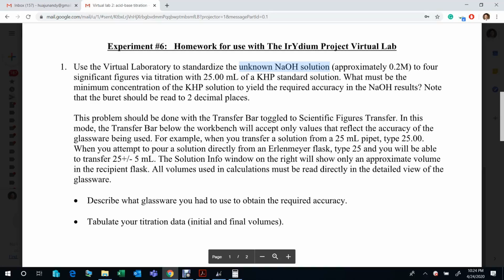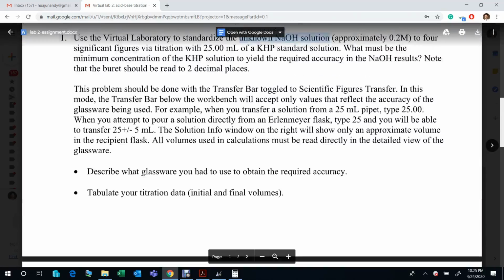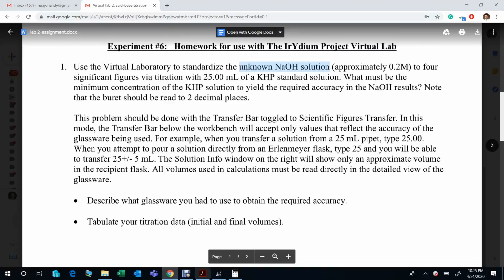You see, just now we recorded the initial volume is 6.9, right? And then the final volume is 12.51 or 12.50, and you can calculate the error is very tiny, so we don't need to worry about that. Okay, so we finished the first part of this experiment.